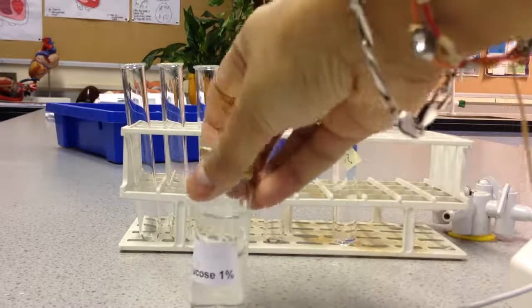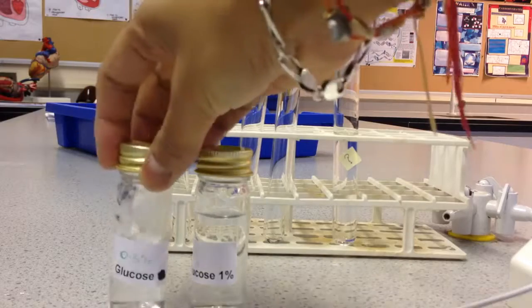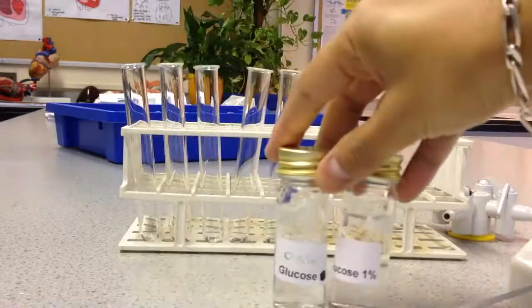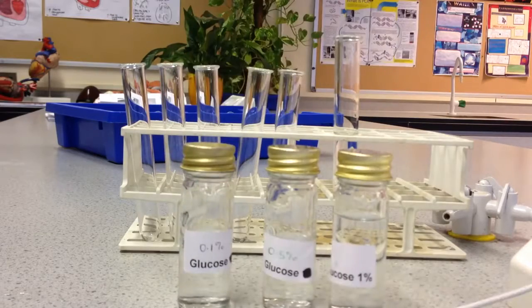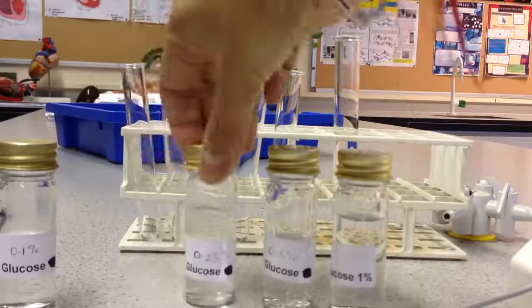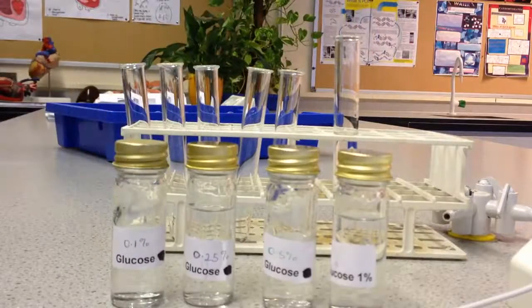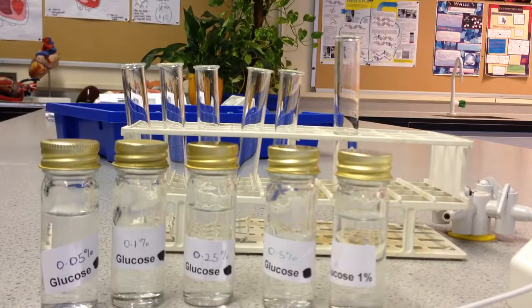Okay, so I have 1%, 0.5%, okay, 0.1%, 0.25%, and 0.05%. Okay, so a range of solutions, all with reducing sugar in them and with known concentrations.